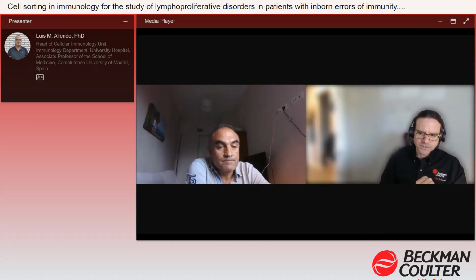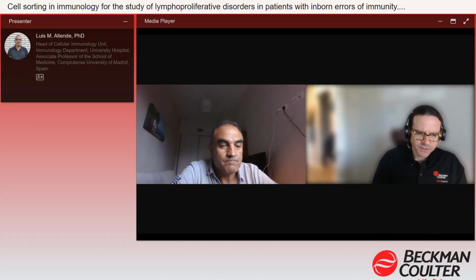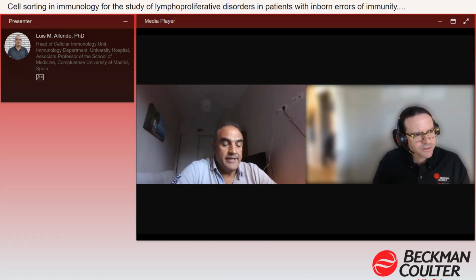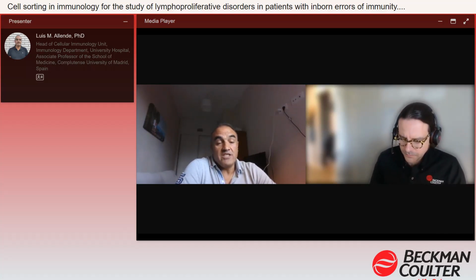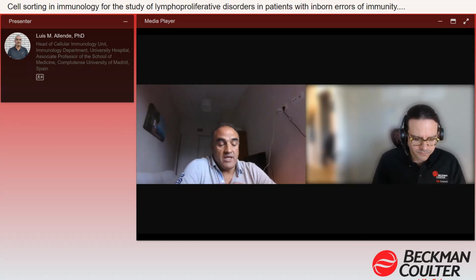And I think this question is less a technical question and maybe where you think things might be headed next. When you find a variant of unknown significance, what do you do next? Okay. I think this question is related to inborn errors of immunity. Functional validation is mandatory, or if the prediction of a new variant is pathological and it has not been reported. In the first step, we usually use flow cytometry to test lymphocyte populations, or even the protein, if we have an available monoclonal antibody. The second step usually is to show if gene expression is affected by using RNA gene expression or Western blot techniques, as we saw in the presentation.